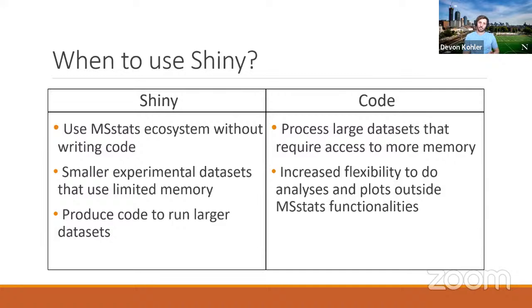So that's just to give you an idea of what's available, and when you might want to use each of these two, the Shiny or the code version. Hopefully you have a better idea of when you would like to use each of them going forward in your own experiments.